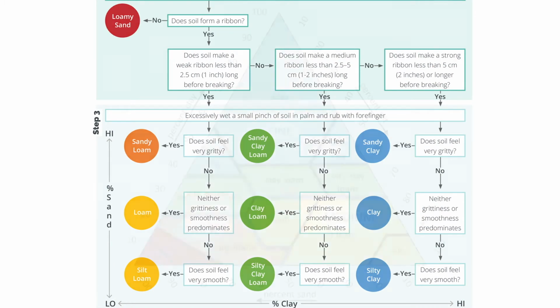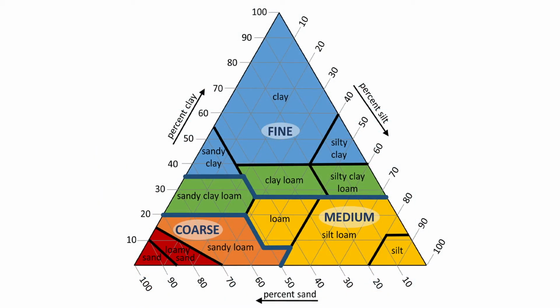And so if we turn to the texture triangle, we can actually then convert that diagnosis into percentages of the various particle sizes, right? So reading here, we have a sandy loam being composed of something around 20% clay max and somewhere between 70 to 50% sand. And a loam being as low as 30% sand. So we're probably somewhere down in that 30% to 40% range, below sandy loam. Yep. Okay, so let's try the next sample.